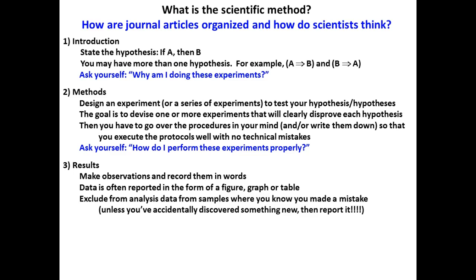So to give you a real example, when you do the gram stain, if you realize you forgot the iodine step, can you rely on your results? No. You know it's not come out accurately. That's an important step in the process. You can't skip steps.